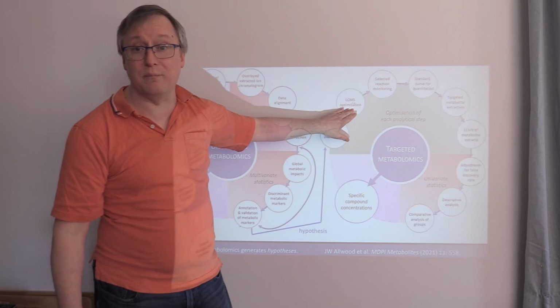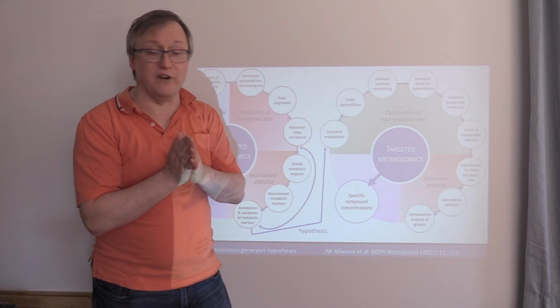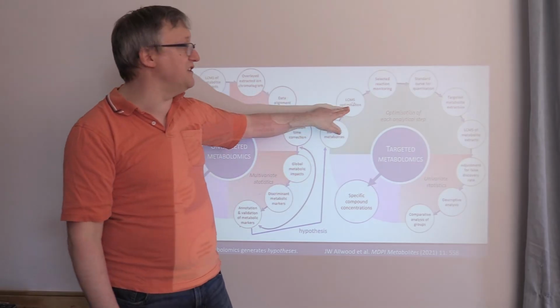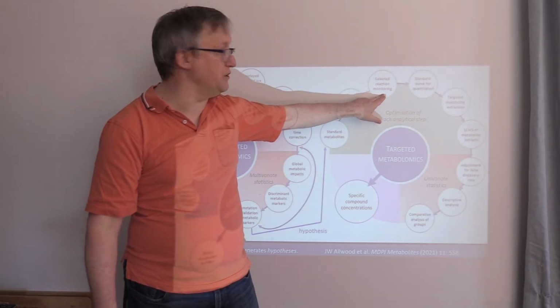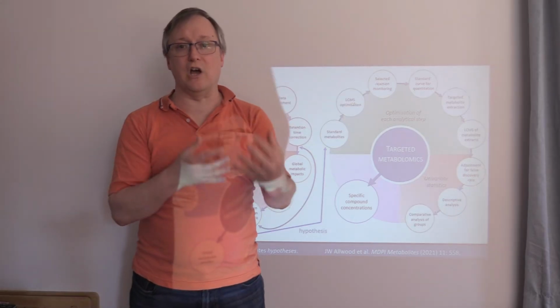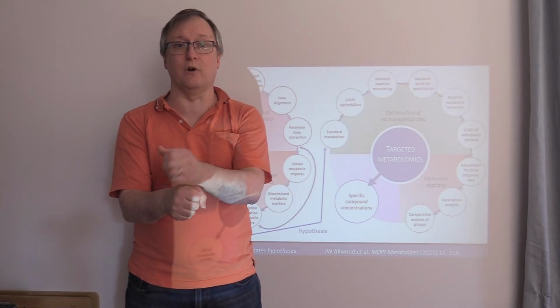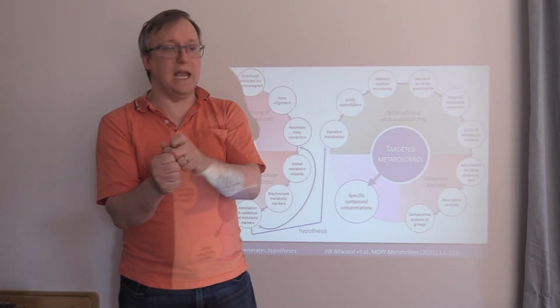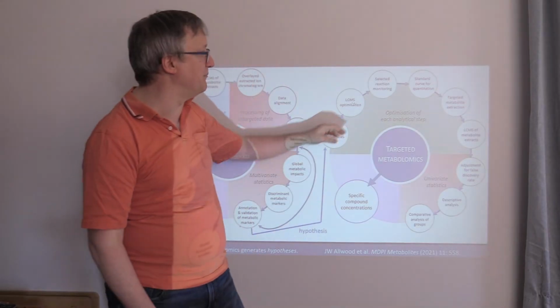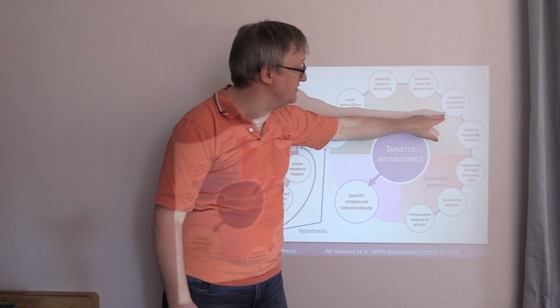We're going to need to improve the way we do LC-MS to give us the very best possible separation of these metabolites. We're going to do a selected reaction monitoring style experiment, one that brings together knowledge of which metabolite ions we are looking for, what their masses are in other words, and what fragments result from them. We're going to need to develop standard curves to be able to quantify these.